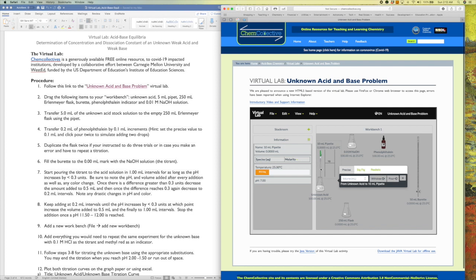And so you can see that the pipette now is empty and we have solution in our flask. What I'm going to say is I want to withdraw the capacity of this pipette, which is 10 ml.